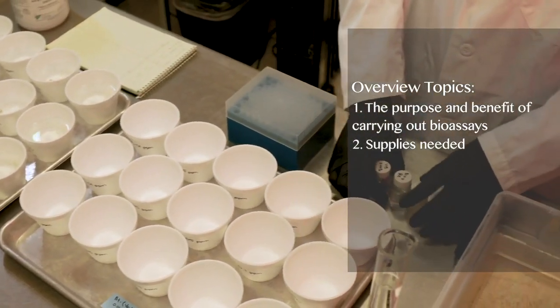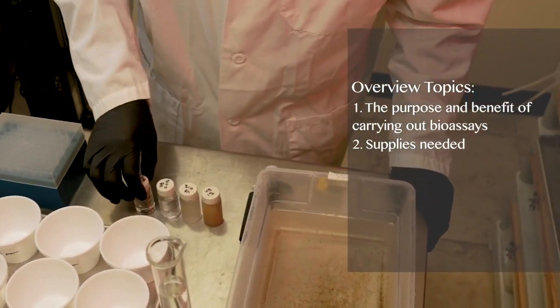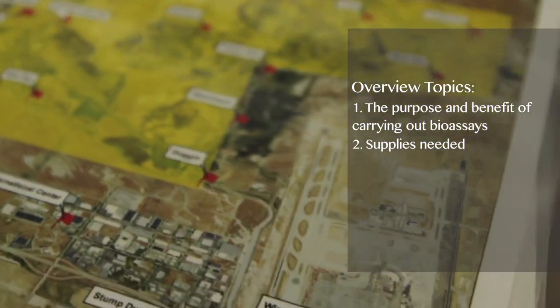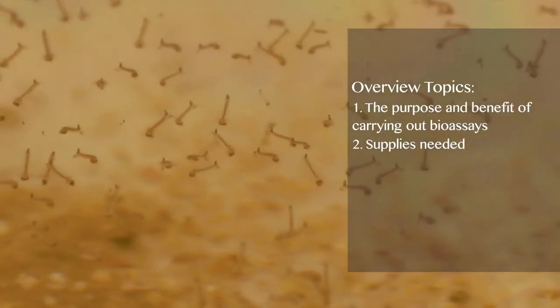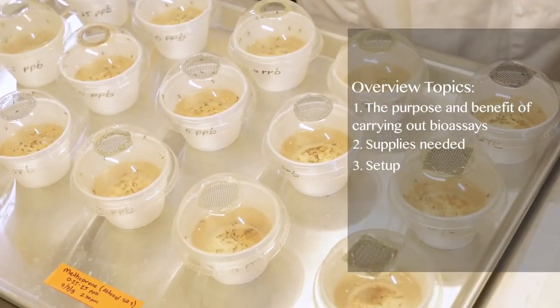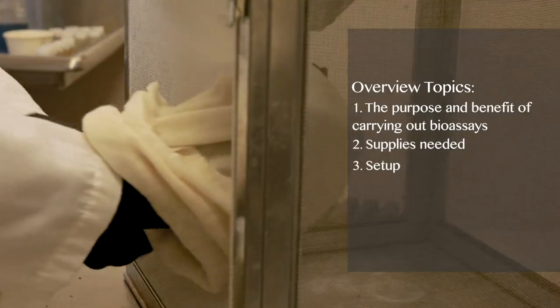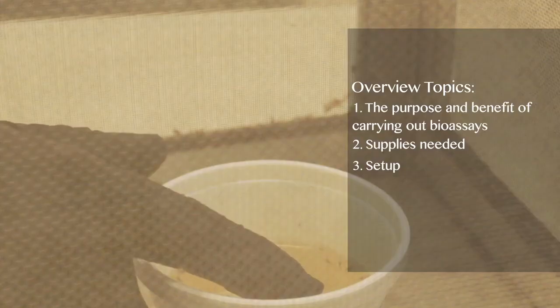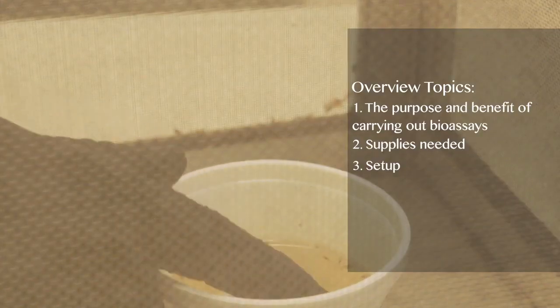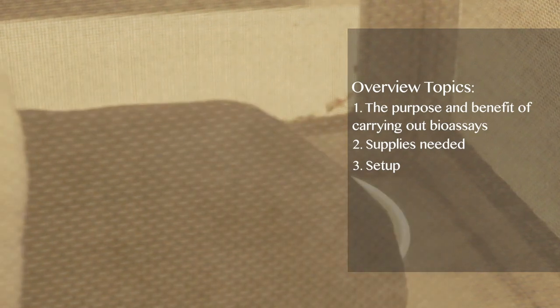Second, what supplies do you need to run bioassays that examine the level of resistance in a population of mosquitoes to various control agents used against the larval stage of the mosquito life cycle? Third, how do you set up a bioassay that has an experimental design that is appropriate for making conclusions about the susceptibility of mosquitoes in your district to larval mosquito control agents?